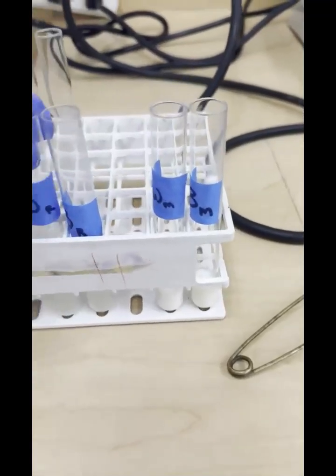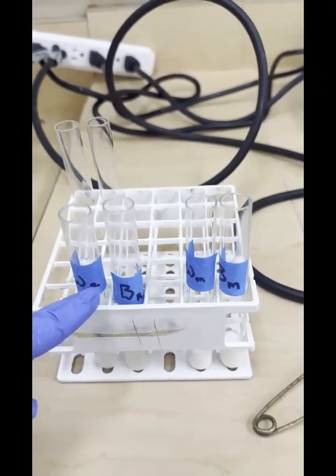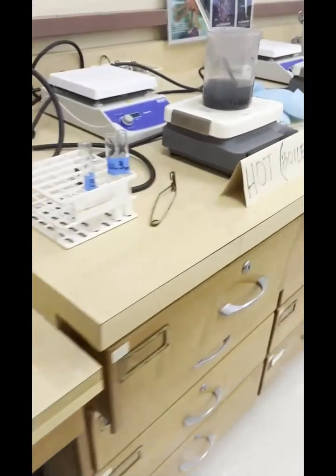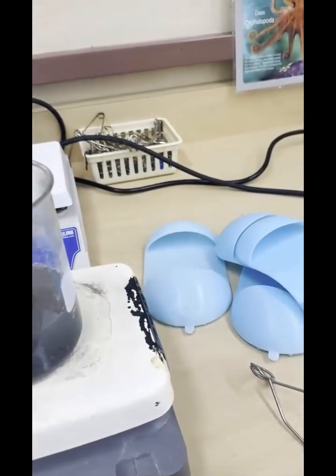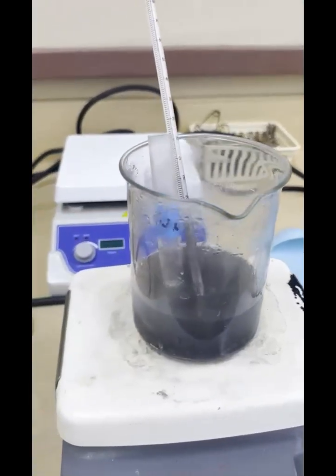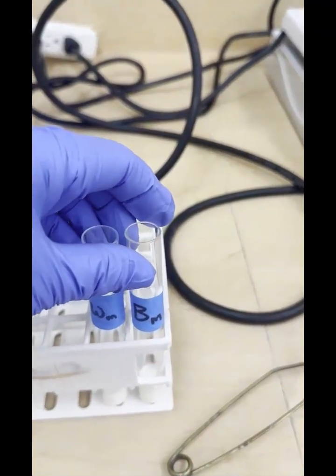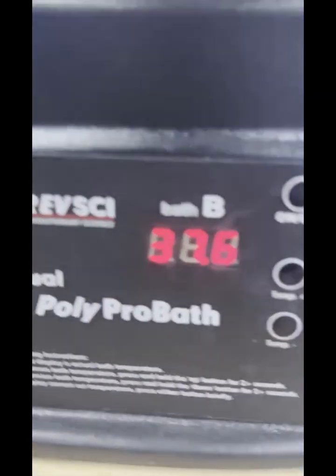For our warm Rennin, I'm going to place that as well as the boiled Rennin, right? So the warm rennet, I'm going to place into the water bath right here. The boiled rennet, I'm going to place into here. And we're going to leave it there for 6 minutes. Now we have our warm milk and boiled milk. Both of these will go into the 37 water bath.